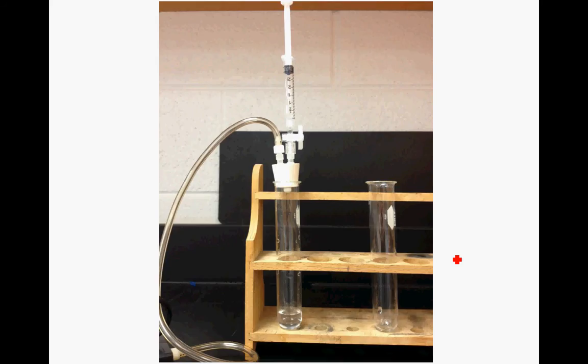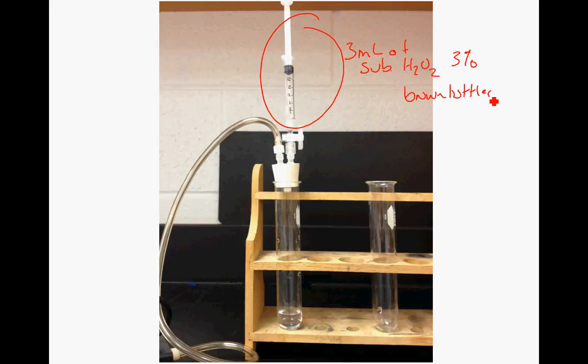Some people are having a hard time just with the setup, so here's a picture again of the setup. In the syringe right here is going to go 3 milliliters of the substrate, right? That is the hydrogen peroxide. Now, making sure that everybody is using the 3% hydrogen peroxide solution, and this is what's in the brown bottles. And we had some confusion with that, different groups using different substrate concentrations. The only group that's using different substrate concentrations are groups that chose to vary the substrate concentration, in which case you're going to be using different peroxide solutions there.